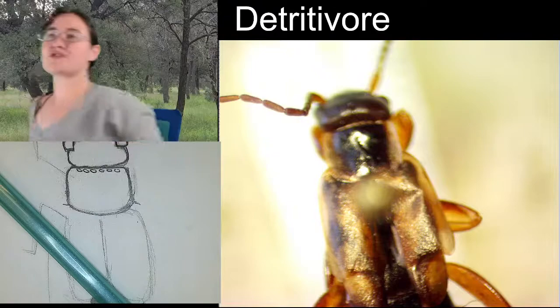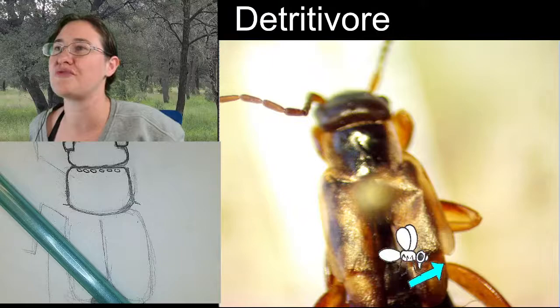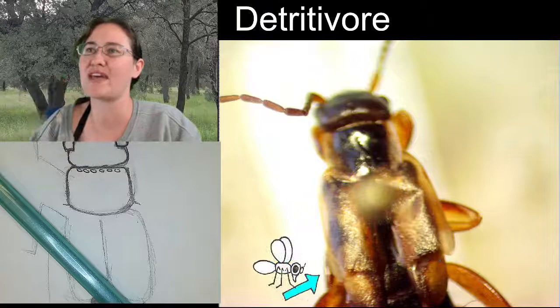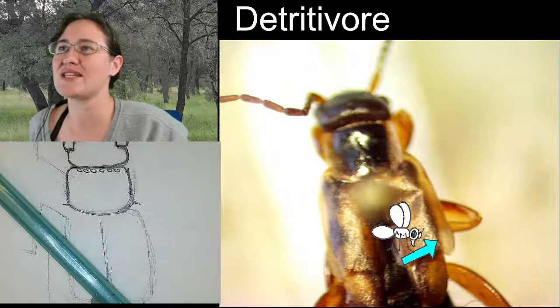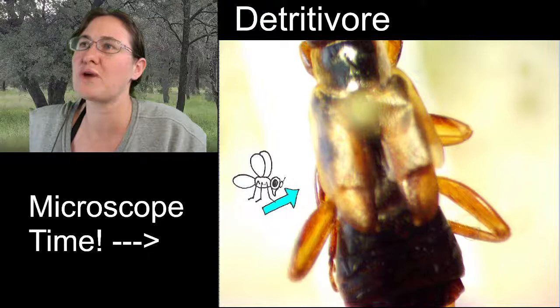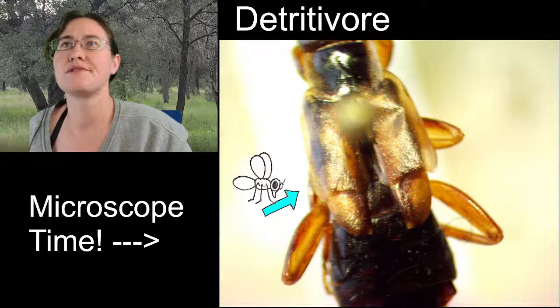I want to point this out. If we're looking here and it goes around the edge, and then you see that it comes in a little bit and then continues moving forward, that little edge and this section here is normally held around the body, kind of tucked over the side. You can see on the left, you can't really see this part here because it is kind of folded down around the body, whereas on this side, it's kind of sticking up. So you can sketch the earwig in either direction, but the left side is more realistic to its natural pose. This side on the right just looks like it unwrapped itself a little bit, but it's a good and cool detail to add too if you'd like.